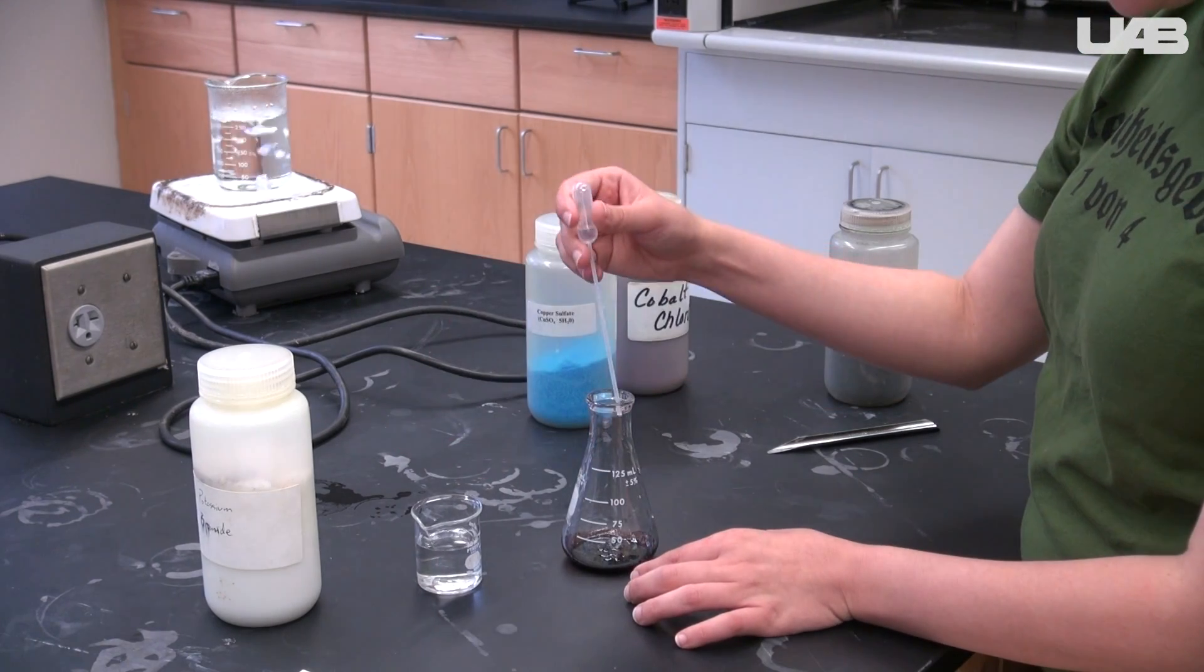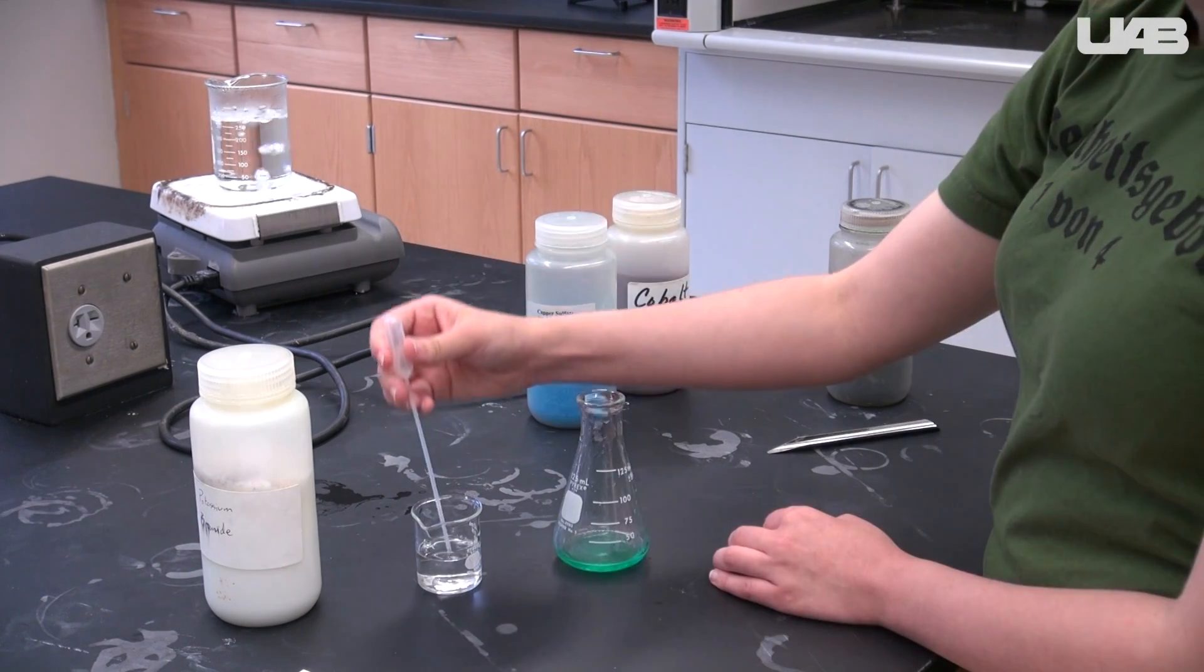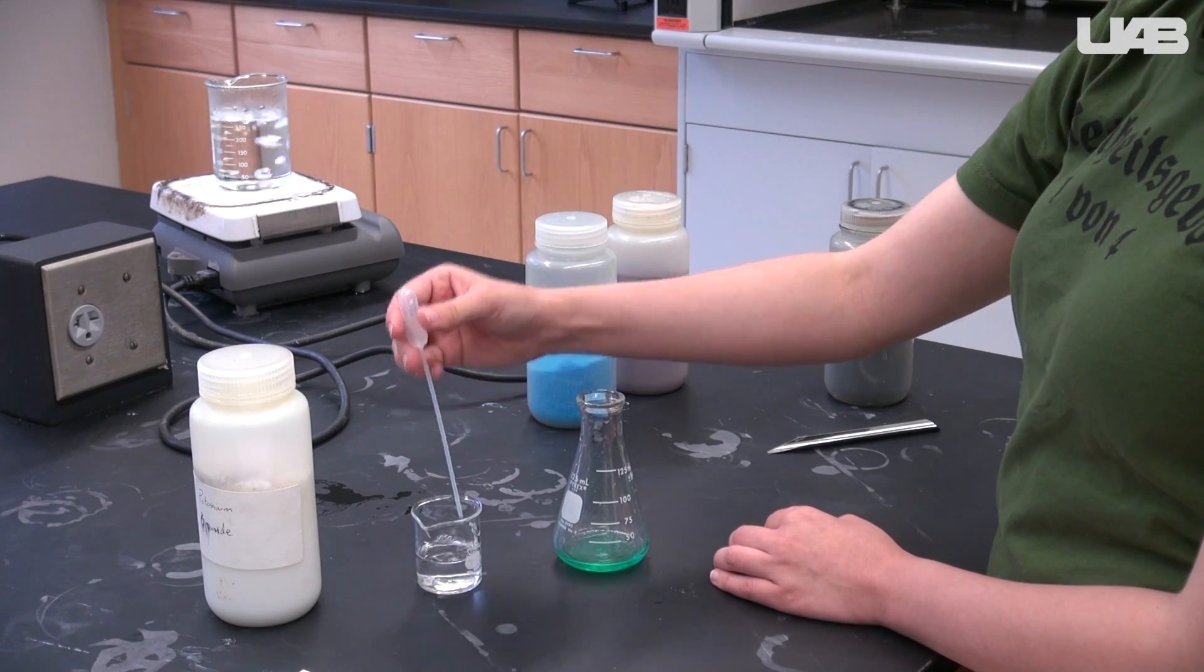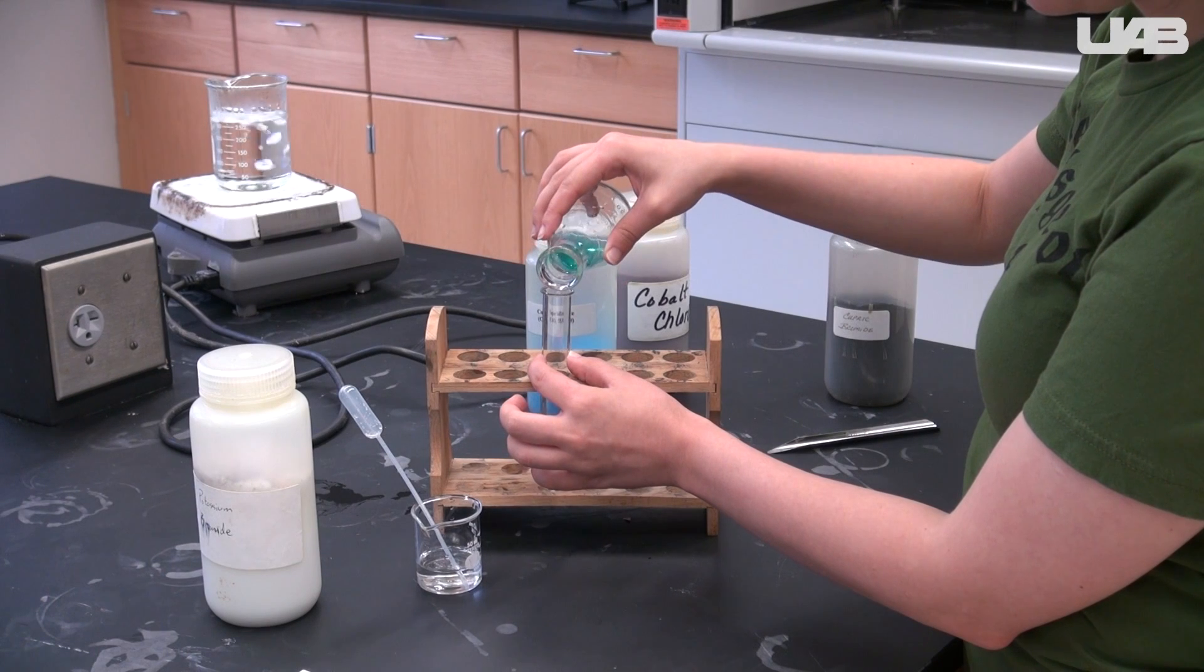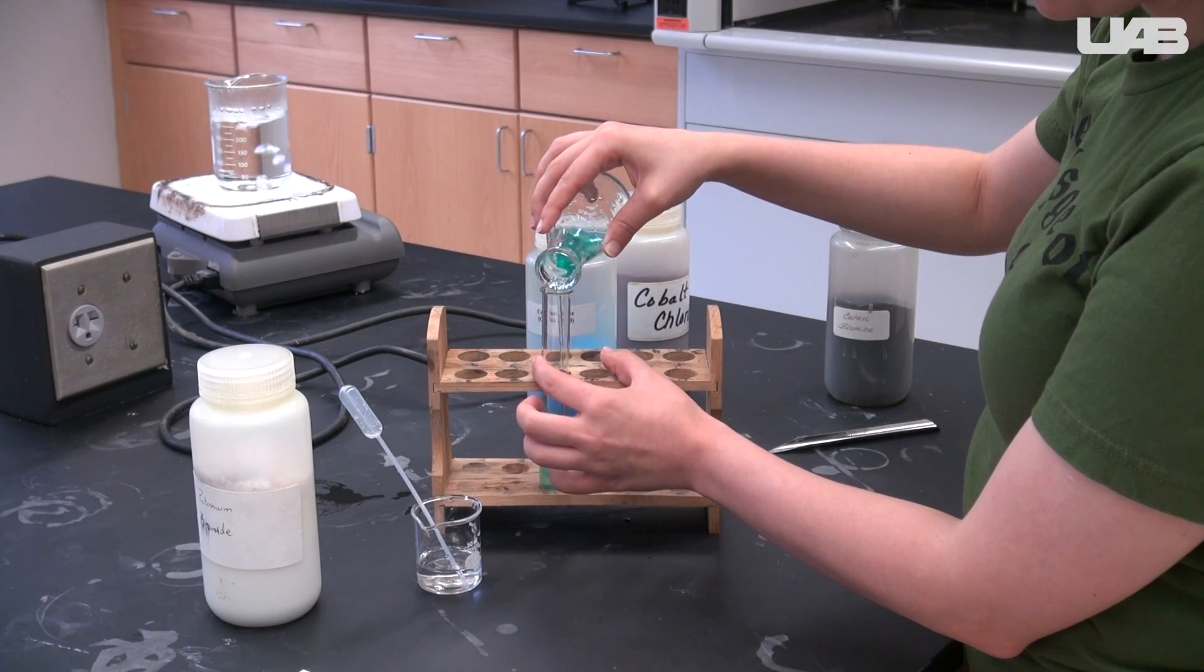Then keep adding distilled water 1 milliliter at a time until there is a total of 15 milliliters in the flask. Record your observations again and decide what the predominant species is now.